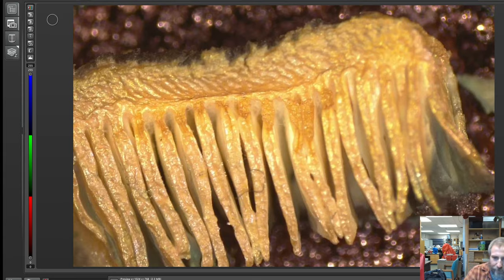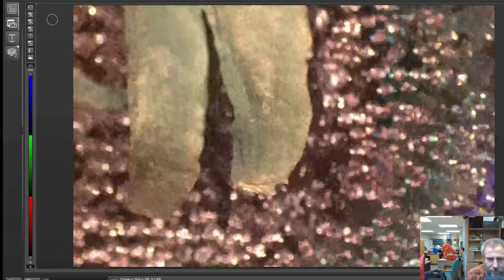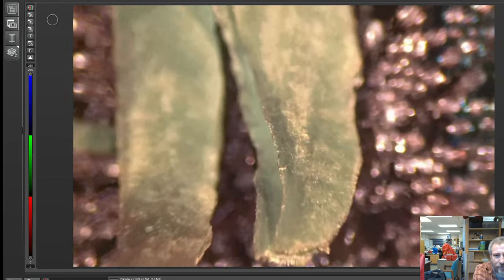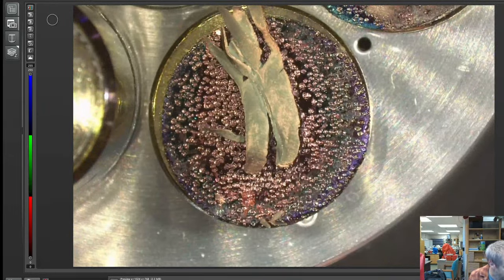And the gills are on the bottom of the cap. So that's a little bit of the cap, and then the gills that are hanging down from it. And then these are the gills themselves. So we looked at some of the gills. I took one of those slices and I basically just kind of rolled them out so you could see them from the side. But this is what we were looking at on Wednesday on the SEM.